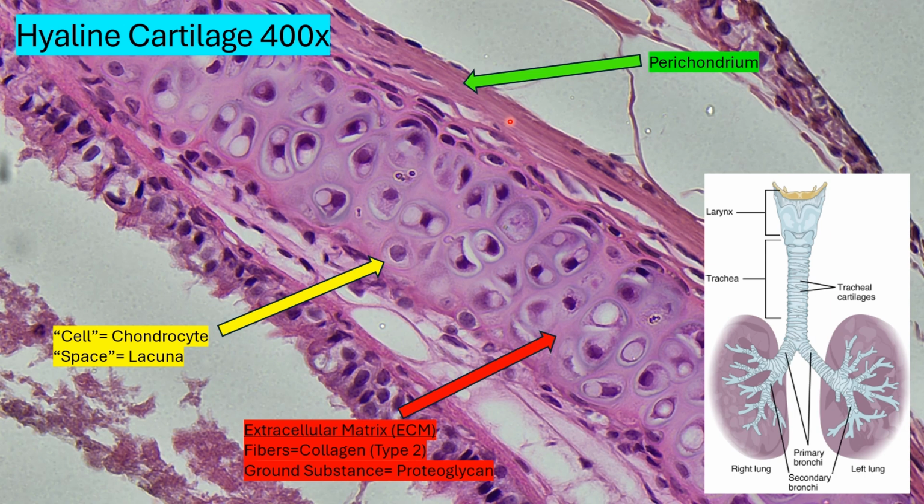So cartilage is a specialized connective tissue and it follows our standard description of what it is. There are cells, the chondrocytes, that help build or maintain the extracellular matrix, which is comprised of fibers and ground substances. So it is a specialization that has to do with the cell types and the ground substance.